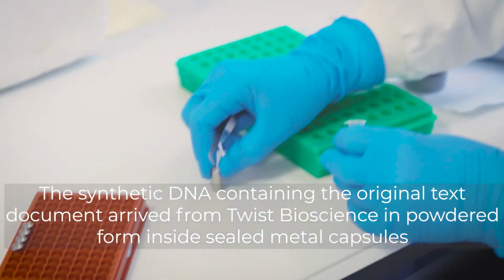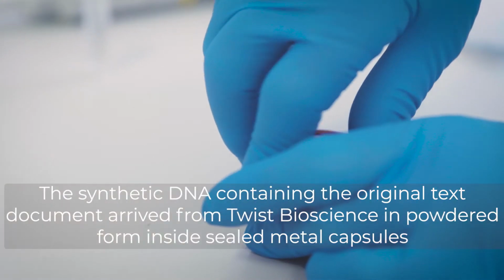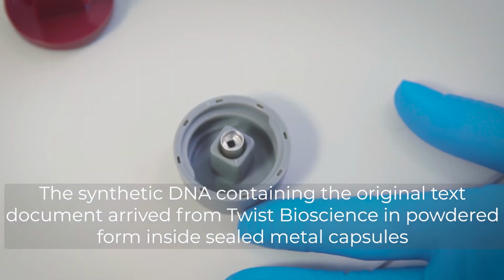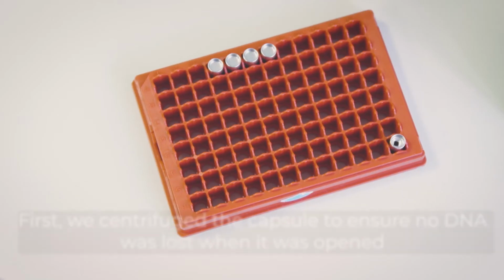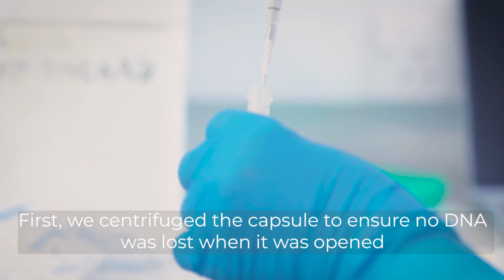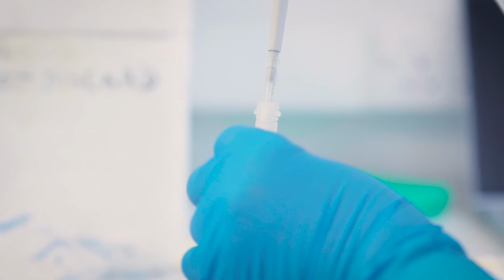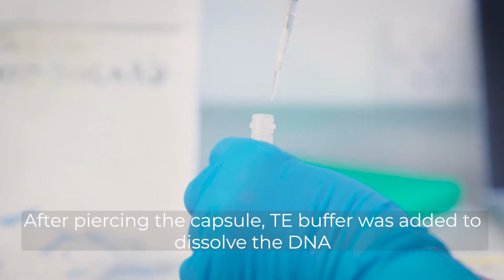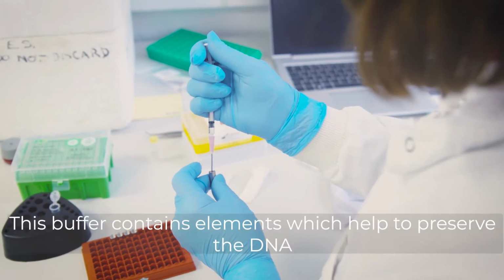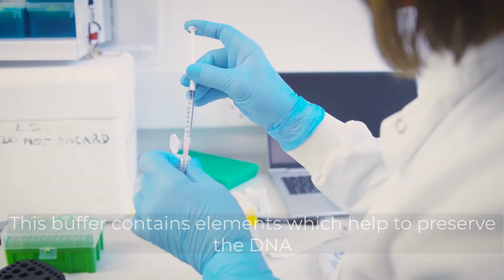The synthetic DNA containing the original text document arrived from Twist Bioscience in powdered form inside sealed metal capsules. First, we centrifuged the capsules to ensure no DNA was lost when it was opened. After piercing the capsule, TE buffer was added to dissolve the DNA. This buffer contains elements which help to preserve the DNA.